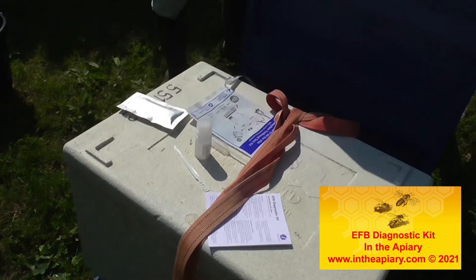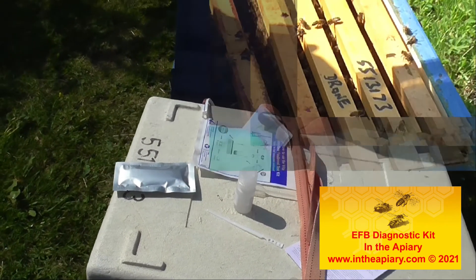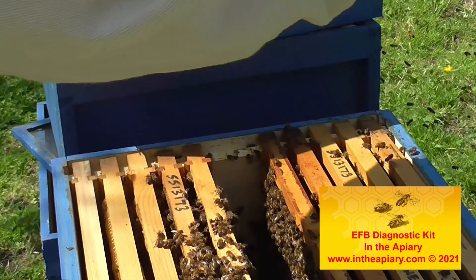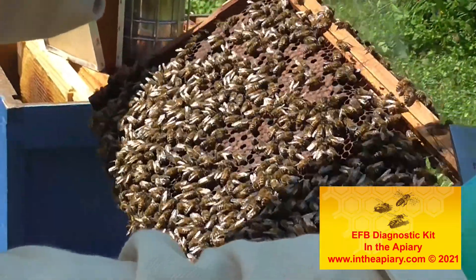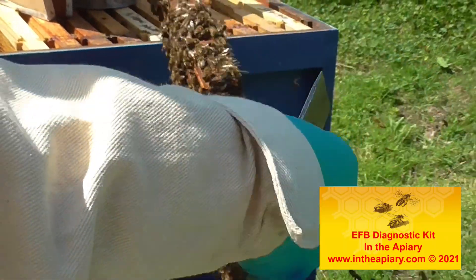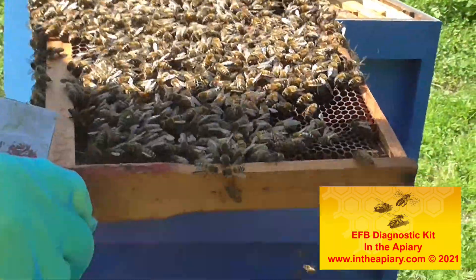Let's get in and have a look at the girls then. Right now it was this frame here where I saw some larvae. So what I'm going to do is shake that frame down.